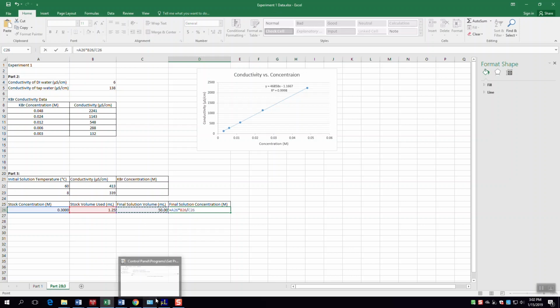And exactly the opposite case with the 8 degrees Celsius water. When the water is 8 degrees Celsius, the water is actually going to have shrunk down a little bit. So when you fill it up and then allow it to warm up to room temperature, it should become slightly larger as it warms up. And in this case, we should expect the conductivity to go down.